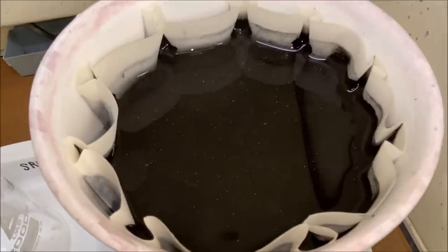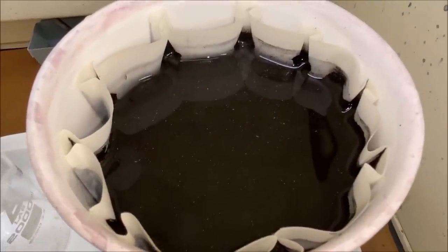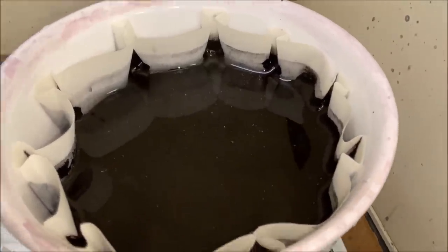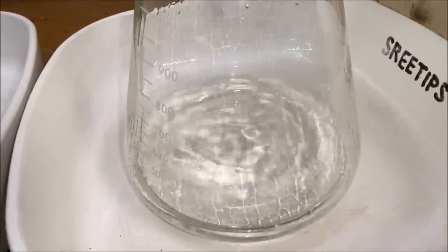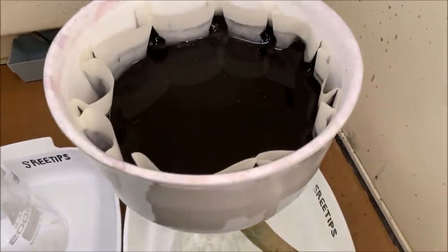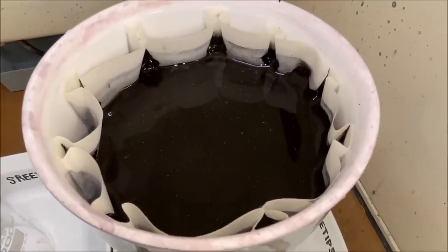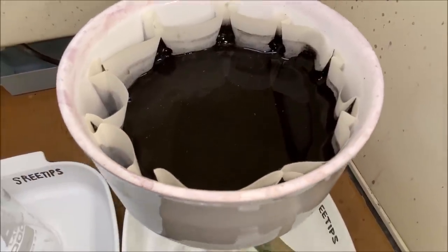What I want to do is treat these solids with nitric acid, but they're in hydrochloric acid right now. I mean, I've done distilled water boils, but no matter how many I do, there's still going to be a little bit of hydrochloric acid left in there. And if I try to add nitric acid into here, it'll start putting stuff in solution, and I want to avoid that. I want to be in control of when we start dissolving these solids in aqua regia.